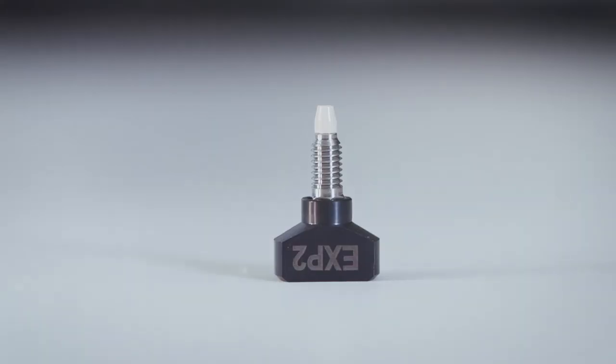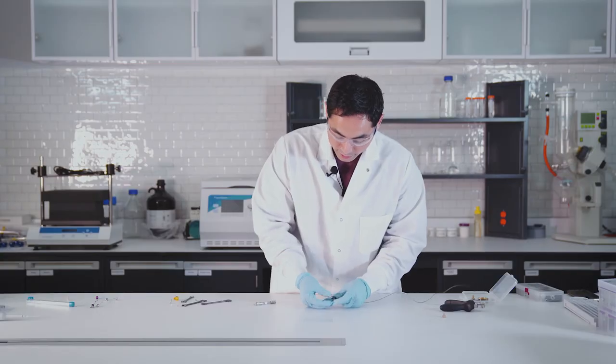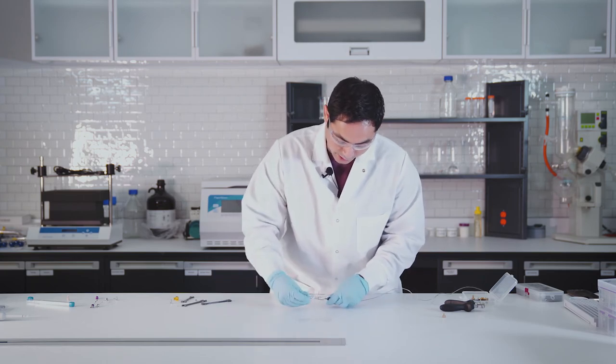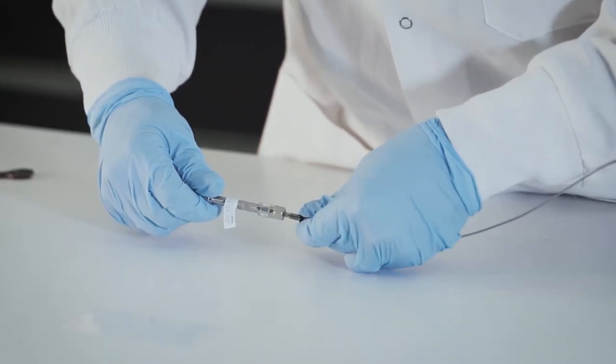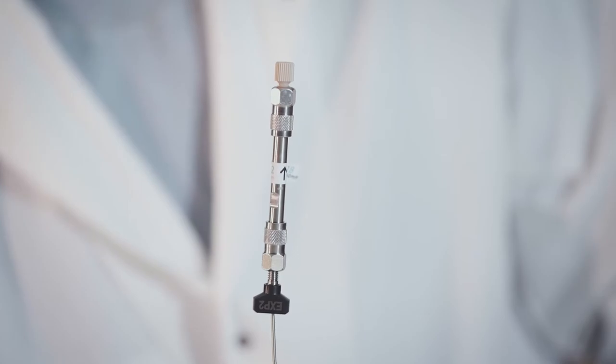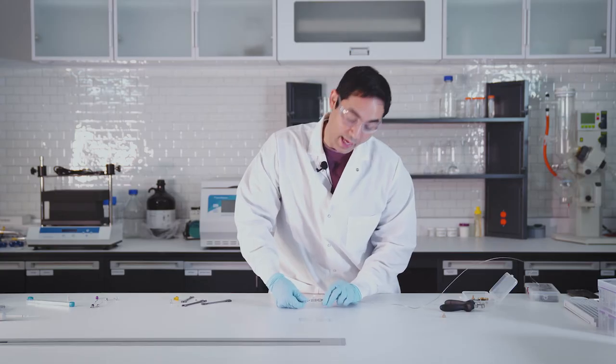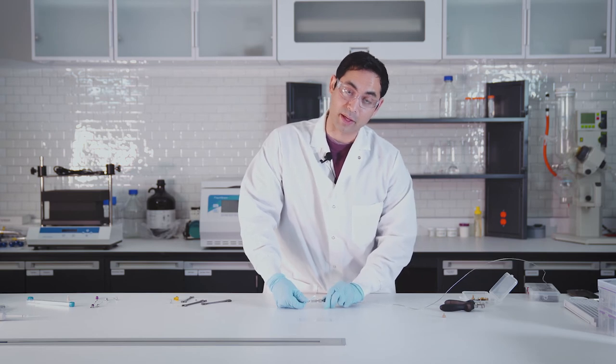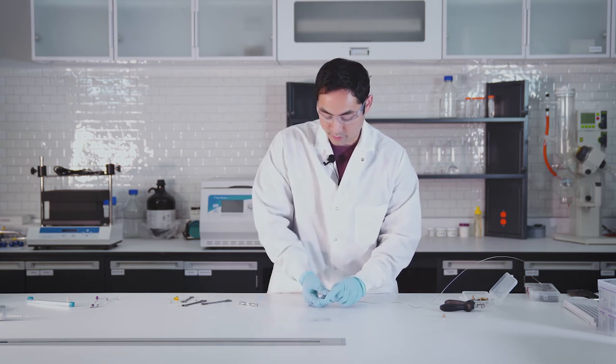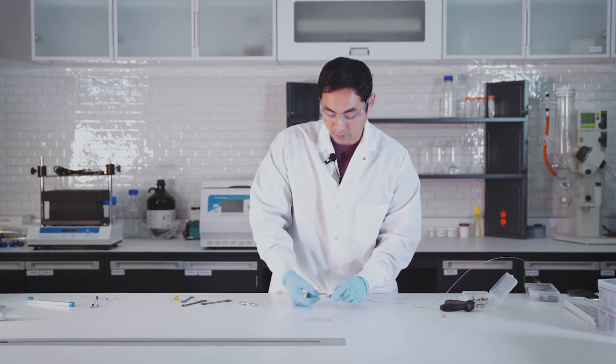If you're using a column you can use the one where the head is adhered on to the fitting. So in this case you don't need that extra tool, this is finger tight and you can get lots of torque. So this is really great for everyday usage because you can take this on and off very easily. So it's finger tight and it's great for UH PLC, so best of both worlds. And it's one piece so you won't have to lose any ferrules or anything like that.